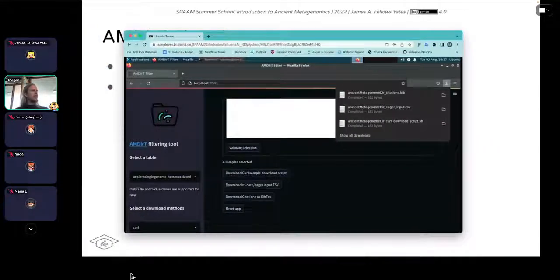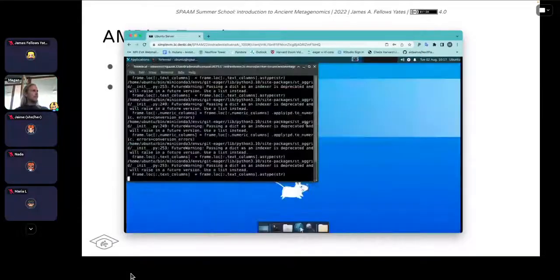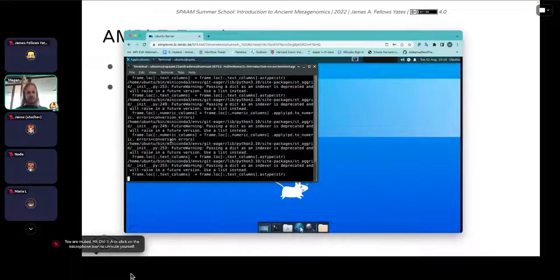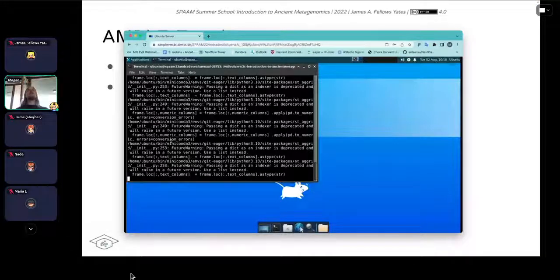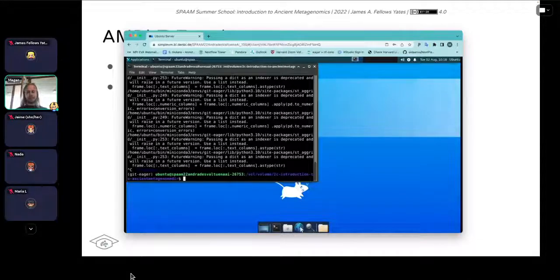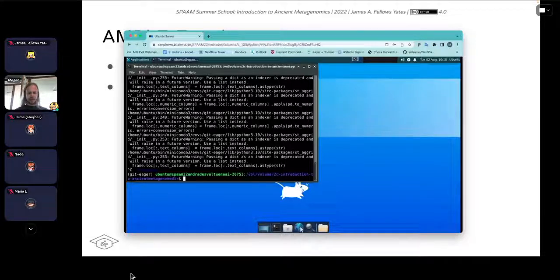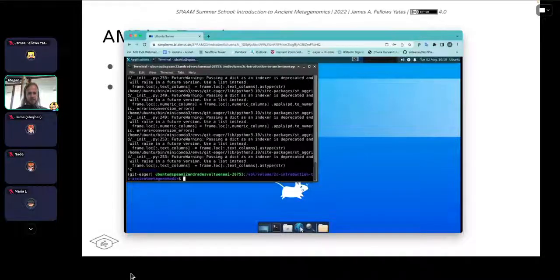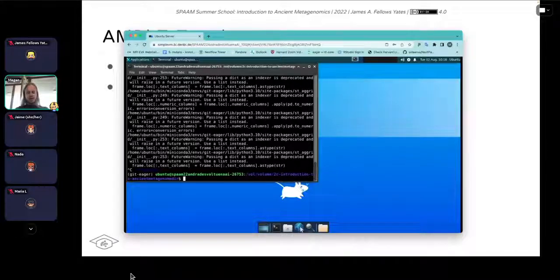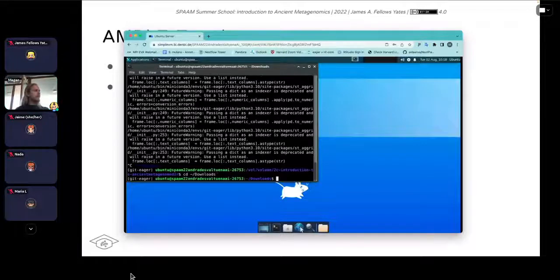You can now close the tab in the web browser. In the terminal, press Control+C to shut the AMDirty tool. Then change into your downloads folder with 'cd ~/Downloads' and run 'ls'. You should see the three files you downloaded.